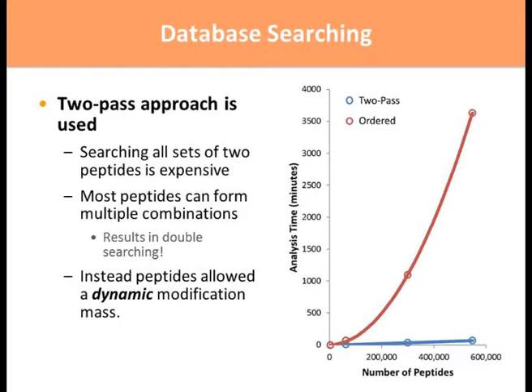You are now searching individual peptides when performing the search. And then identifying what that second peptide is is a separate process that is very quick. So the actual time is reduced back to this linear growth function typical with your standard search engines, and therefore it is possible to get through large data sets using the Kojak algorithm.